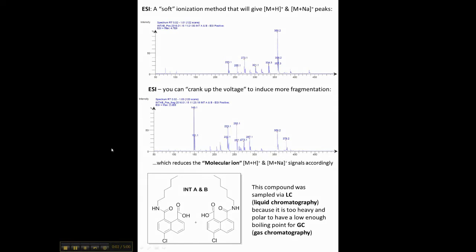This video is about understanding the mass spectrum data that we collected for Lab 1. In particular, what I want to point out is that in all mass spectra, what you usually see is something like this, where there's a peak on the far right that is actually the most interesting peak in many ways. It is the molecular ion peak, or alternatively, the peak that corresponds to the mass of the compound, either plus sodium or plus hydrogen in the case of ESI.